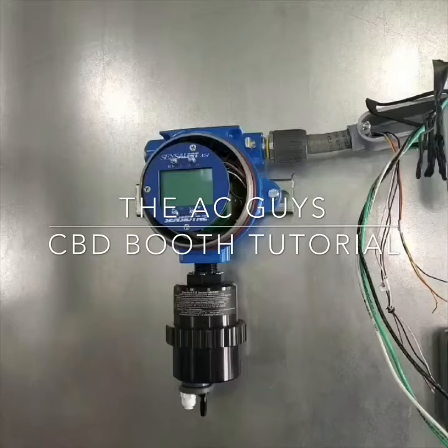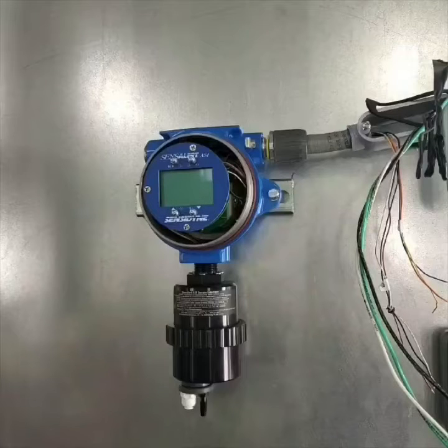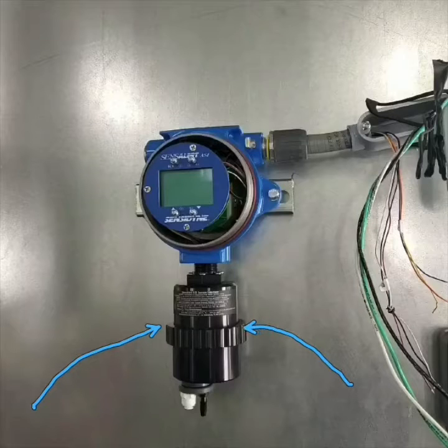Hey everyone, it's Troy with ACGuys and we are at the final stage of our installation of the ventilation equipment for the CBD extraction booth. Before we get started, I want to point out this is probably the most important piece as far as a safety element this entire booth will have. Inside this canister is the ethanol sensor — it's an infrared sensor, very precise and very sensitive. It detects ethanol, or whatever gas we set it to, down to 20 parts per billion of particulate.